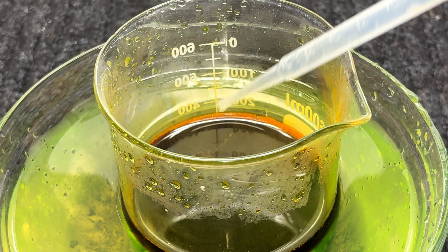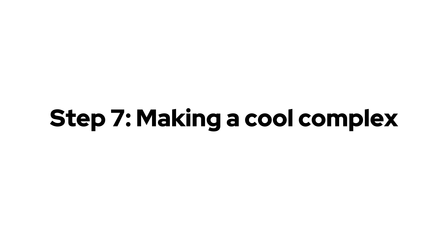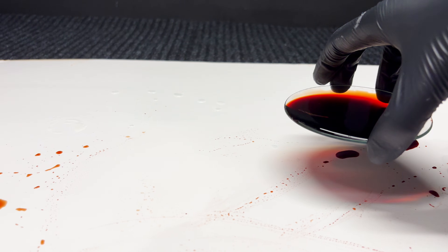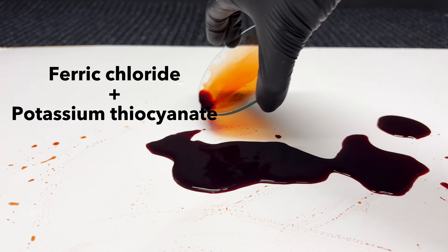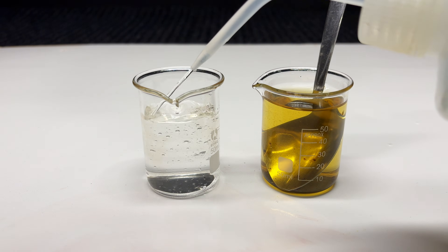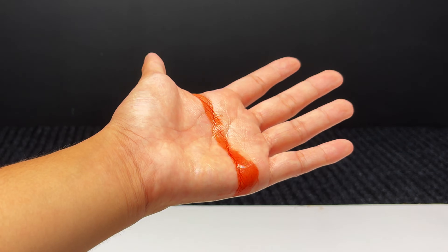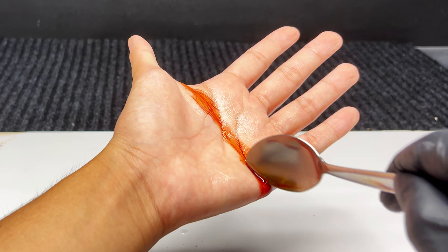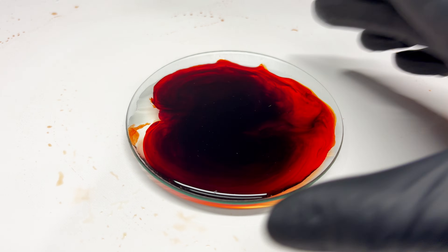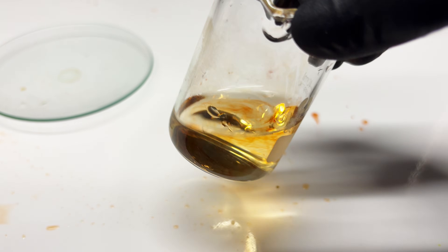Step 7: making a cool complex. I'm going to do one of the coolest reactions I've seen — also great for Halloween. This is the fake blood demonstration, an equilibrium reaction between ferric chloride and potassium thiocyanate. In the first beaker I made a dilute solution of ferric chloride; in the second, a solution of potassium thiocyanate. If I pour the thiocyanate solution on my hand and slide a spoon dipped in ferric chloride across my palm, when the two solutions mix they form a blood-red complex — almost like real blood. Because this is an equilibrium reaction, it can locally favor formation of the complex, but once mixed and diluted, the equilibrium shifts back towards the uncomplexed ions.